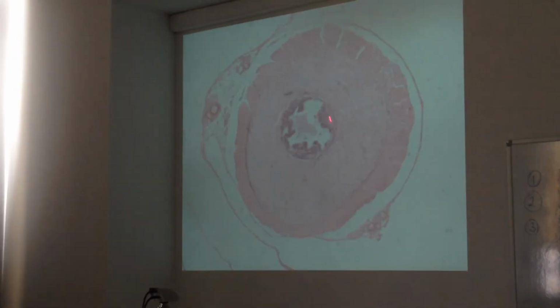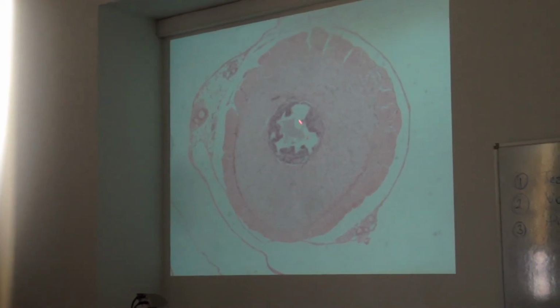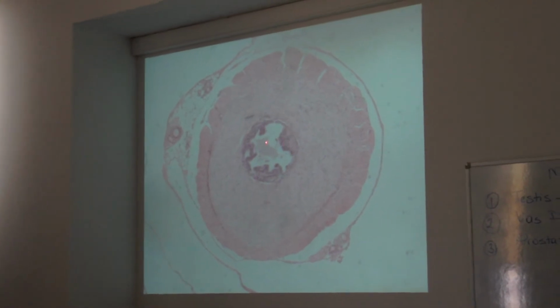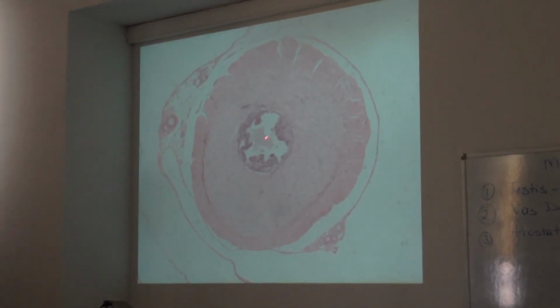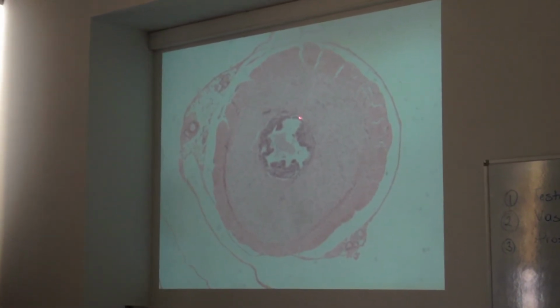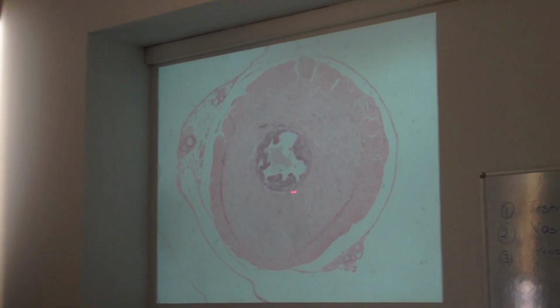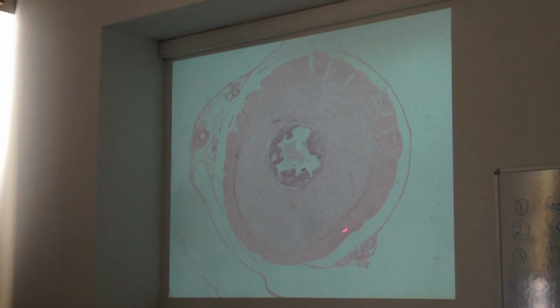This is the epithelium, pseudostratified columnar epithelium with stereocilia, like epididymis, and it has not straight but a little bit convoluted, irregular epithelium, and the thick muscle layer is very distinct. There is a first layer, longitudinal, then comes the inner circular and the outer longitudinal again.